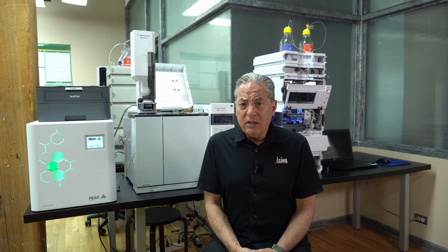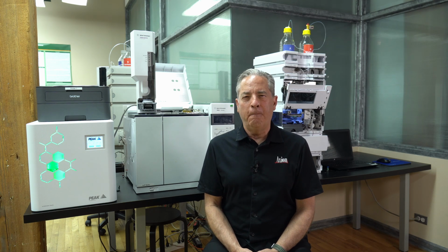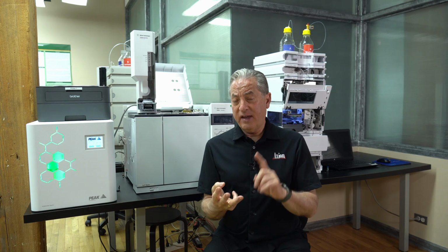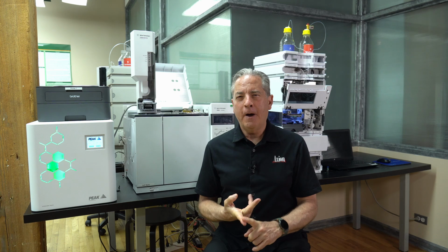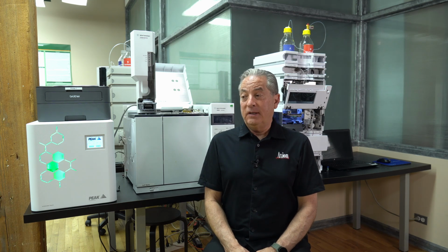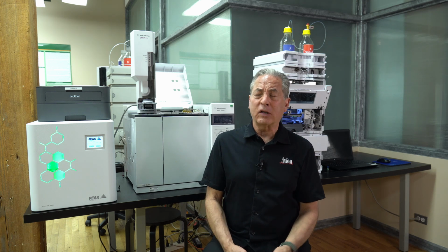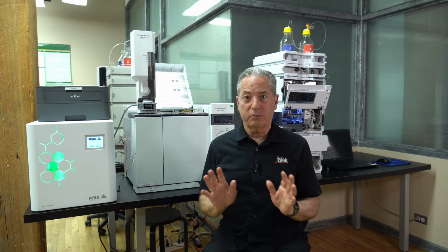The most dangerous thing about the GC is not the instrument, but it's the tank of gas you have sitting in the back room. It depends on how they're running the instruments, but historically we'd have 3 tanks of gas for each GC. We have helium for carrier gas, we have hydrogen for fuel, and we have air for oxidant. Those pressurized tanks are 2,500 PSI. They're essentially bombs waiting to go off. If you were to break the neck off of one of those bottles, we've all heard the stories, it goes through walls. If it breaks the hydrogen cylinder, we have a major explosion problem.